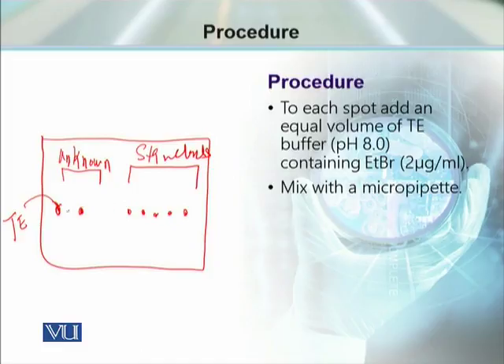Then mixing it with a micropipette. This mixing will thoroughly mix the DNA sample and ethidium bromide. Once mixing is completed, switch on the UV transilluminator.